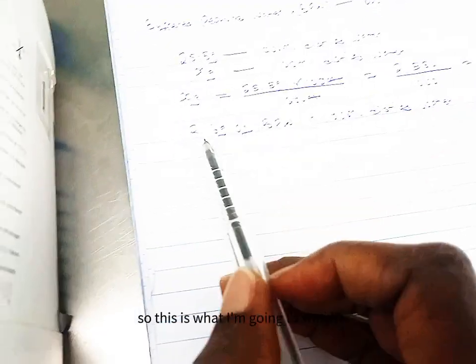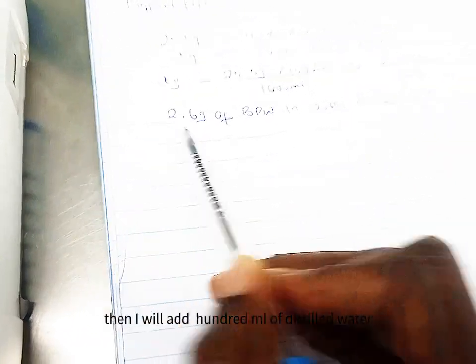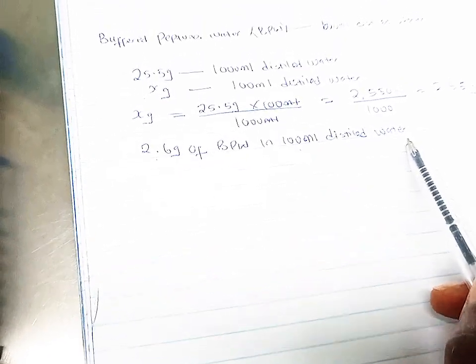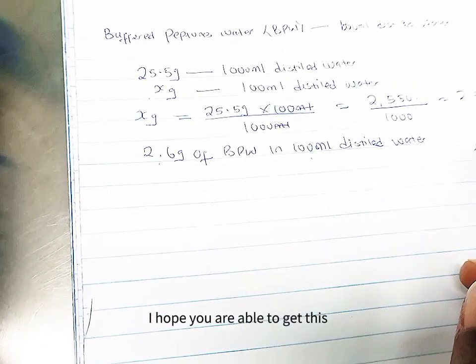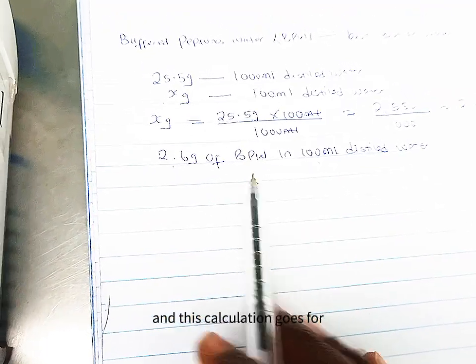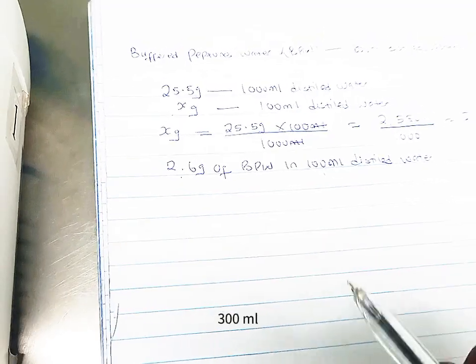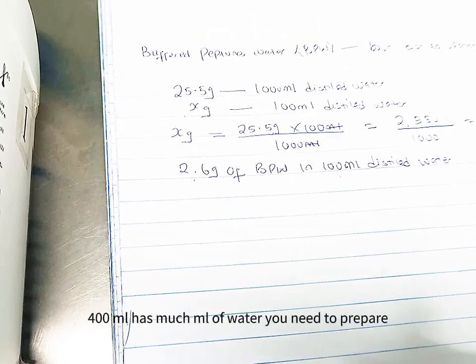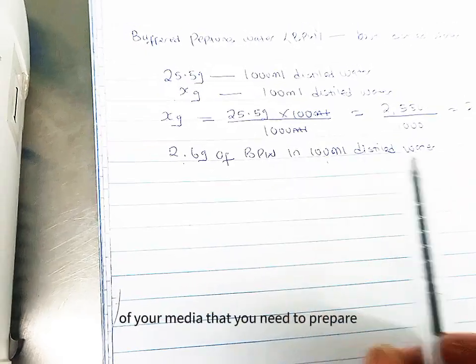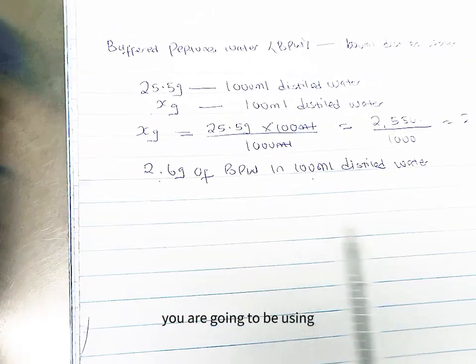So this is what I'm going to weigh. Then I will add 100 ml of distilled water. I hope we are able to get this. It's a simple mathematical calculation, and this calculation goes for even if you need to prepare 200 ml, 300 ml, 400 ml, as much ml of your media that you need to prepare. This is the basic calculation that you are going to be using.